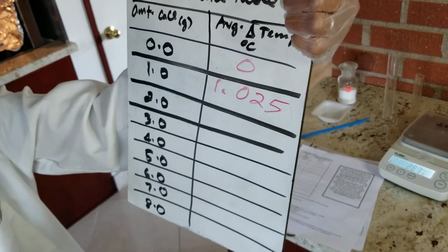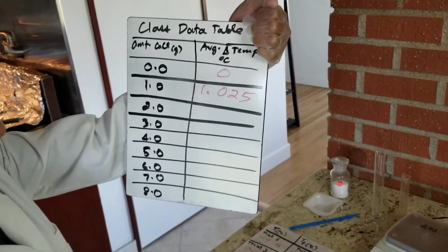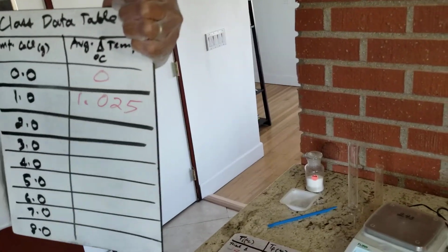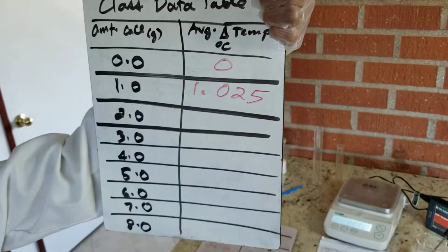At 2, I'm going to leave it blank because you need to do the calculation for the sample data I provided. Meaning, based on this, you could fill in the table in the front and use your average change in temperature to fill in the 2 grams.